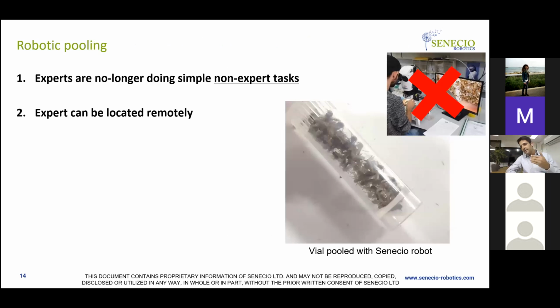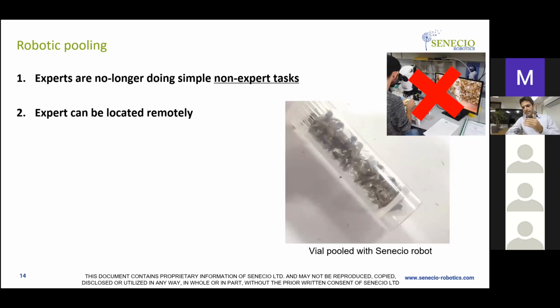Then the ones that the machine automatically identified move on the conveyor to the next station. At the next station, we have a robotic arm. We know exactly what the XY coordinates are from the previous camera, the top view camera, and then we send those coordinates to the computer, which then picks the mosquito and automatically places it inside the vial. What we see here on the bottom image is an image from one of our tests in which the robot actually put mosquitoes inside a vial.